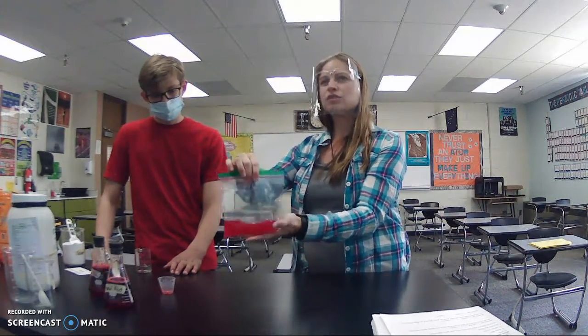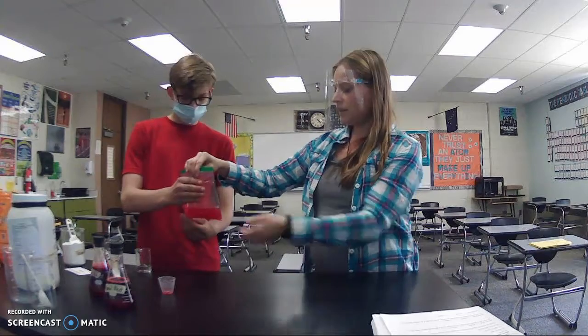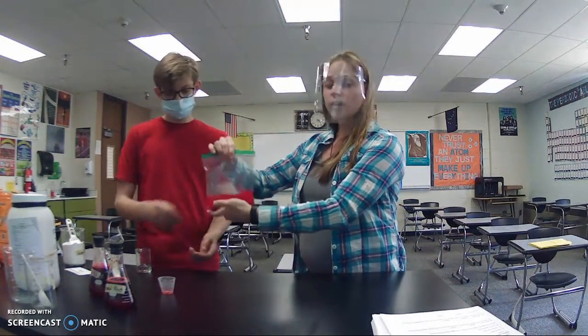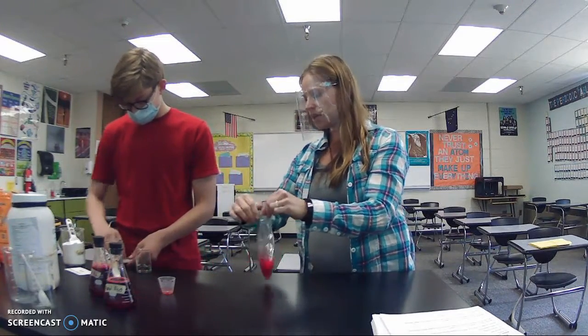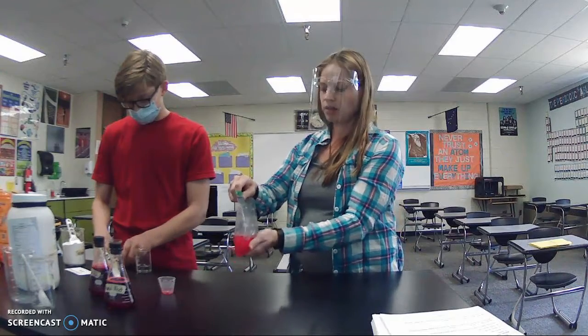You can notice, you can't really see a great change of color, but what do you feel? Yeah. It's very warm. It's very warm. Okay, so now we're going to do another flame test. Okay, see if any gas was produced, if a specific gas was produced. Ooh, very warm.